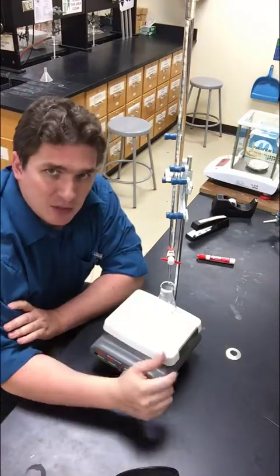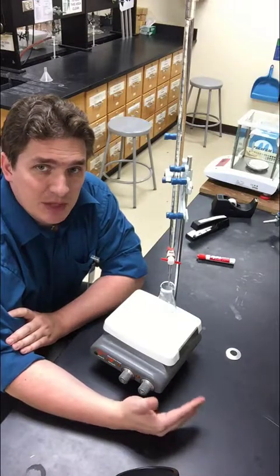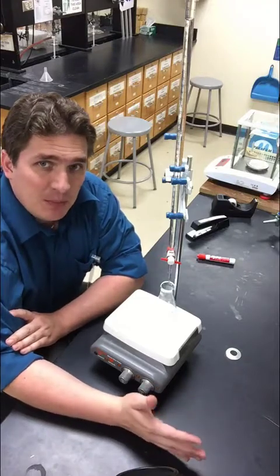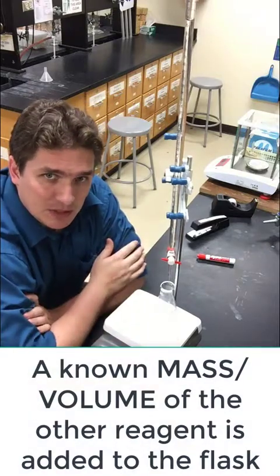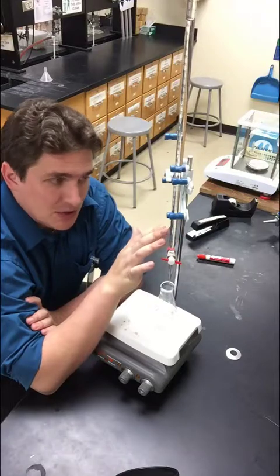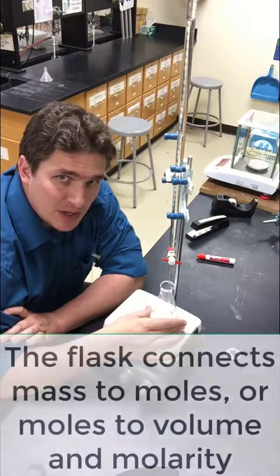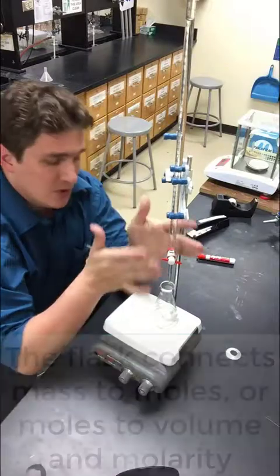And then to our flask, we're adding some known or unknown. So in Chemistry 1, it could be potassium hydrogen phthalate, KHP. It could be acetic acid. But the point is, we know something about what we're putting in here, and we know something about what we're putting in here. Now in this case, we're going to use concentration in terms of molarity and volume in terms of the amount we deliver to relate this to moles. And we're going to use something about this, either the mass or the volume and the concentration, to relate it back to moles.